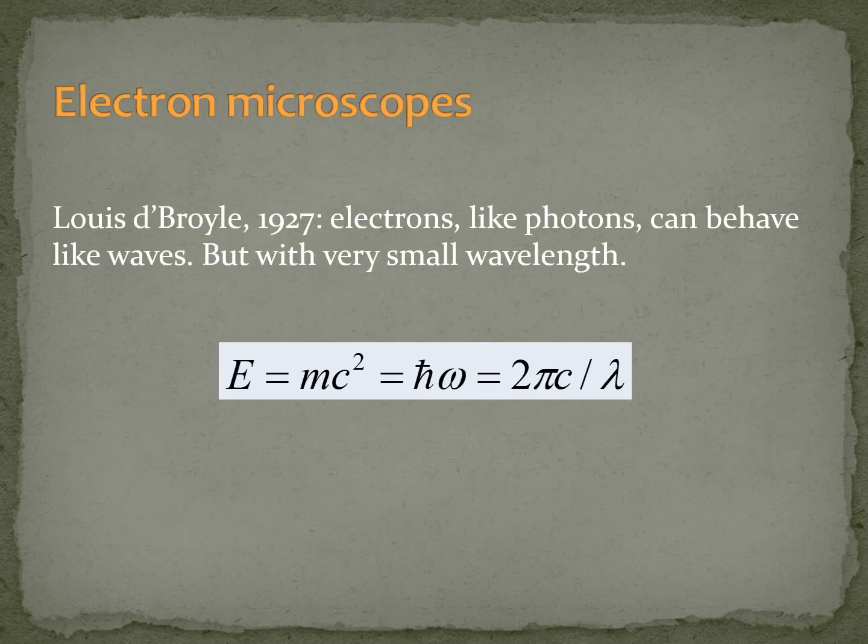That doesn't mean that we cannot magnify our samples more and more, either by using mathematical tricks, let us say, but the oldest way to have a higher magnification was, instead of changing the light, we can use waves that have a very small wavelength, like a beam of electrons.